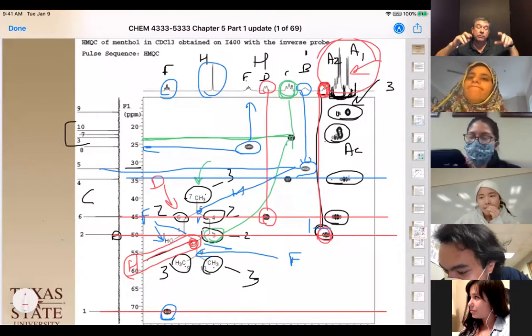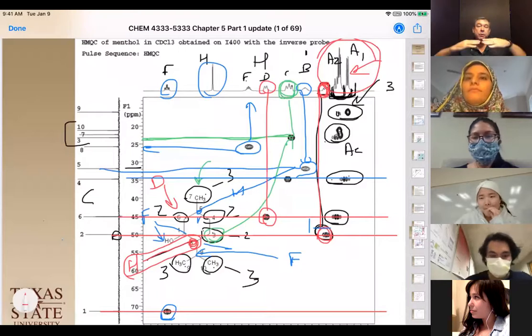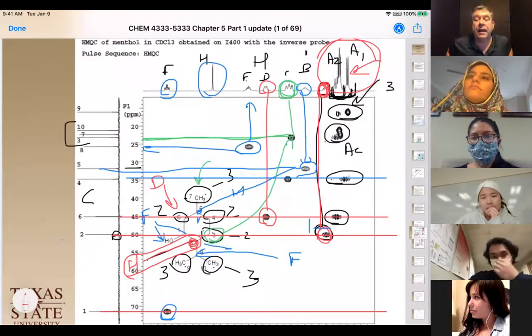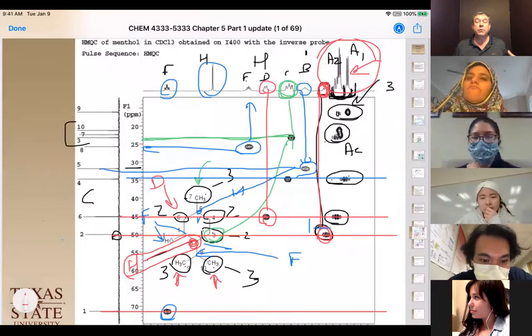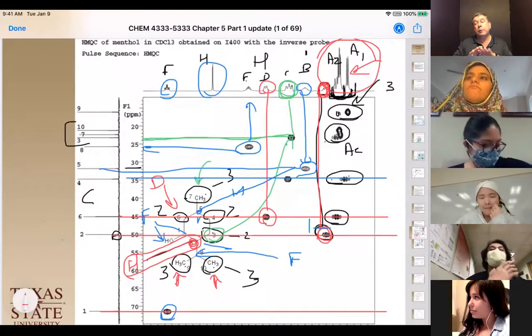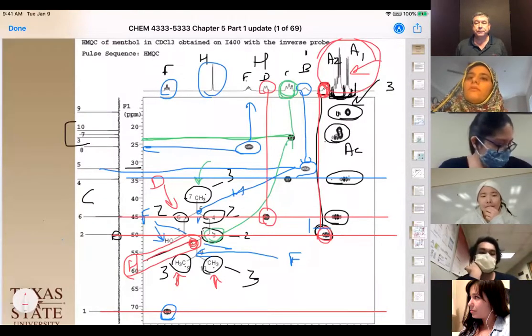And even though it's, quote, fixed in space and can flop right here, because we have that big isopropyl group, it's going to be stuck where that isopropyl is, probably at the equatorial position. And that's going to change where we see these two peaks in particular, because they're kind of locked in place because of the ring. So if this was a long chain alkane where we had all that free rotation, we would probably see a greater separation. Okay.